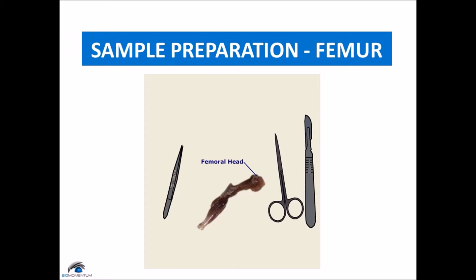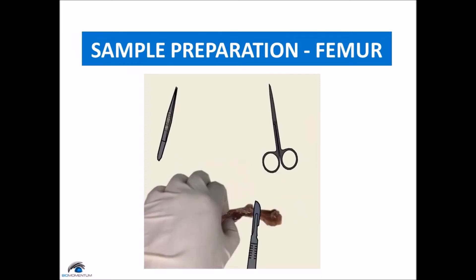Then remove muscle from the entire femur so that the bone is completely exposed. Be very careful not to cut the femur, as it will compromise the test sample.